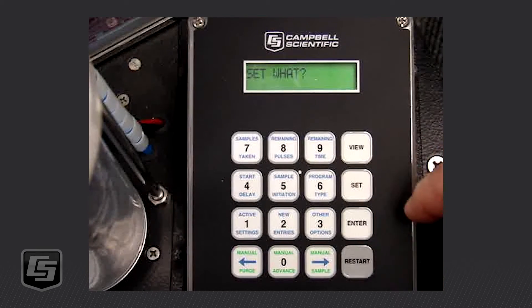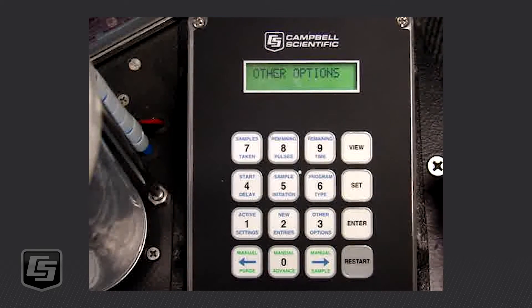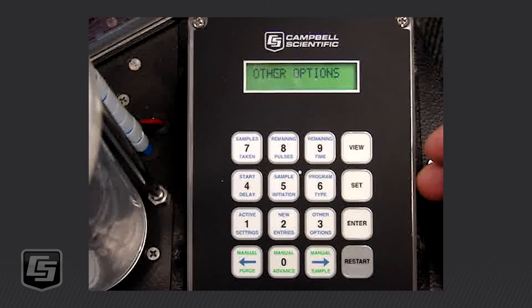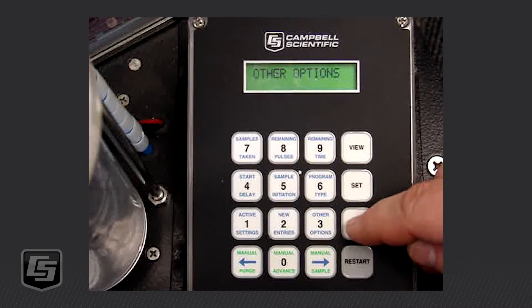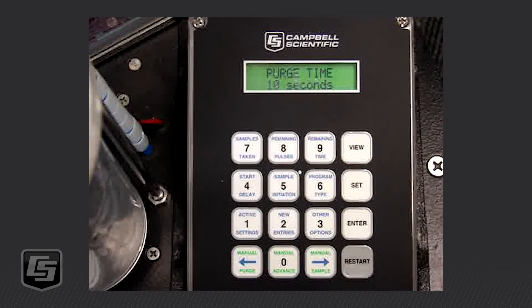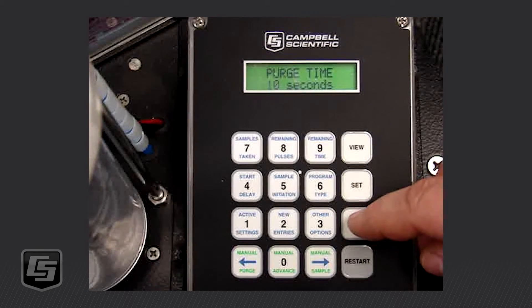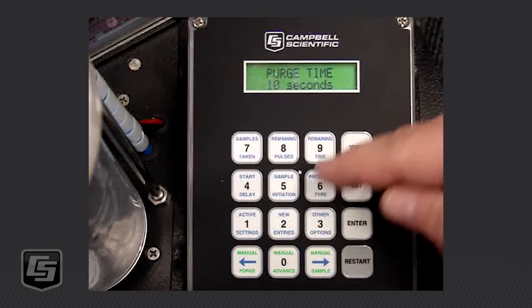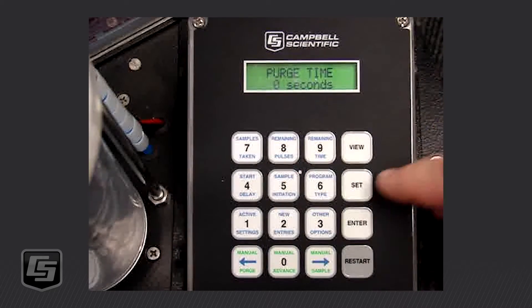So the first thing we're going to do is push SET, and we want to do number three — other options. It will come up flashing with a message that says 'Purge Time.' While we're here, we do want to look at the purge time. For a 25-foot hose, you want to have 10 seconds at the EPA recommended flow rate of two and a half feet per second. If you have a longer hose, you'll want to change that. For example, if I had a 50-foot hose, I would change that to 20 seconds and then press Enter.